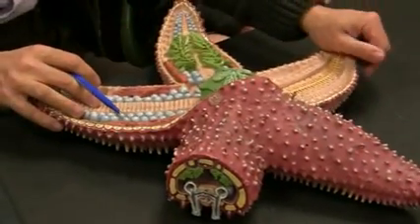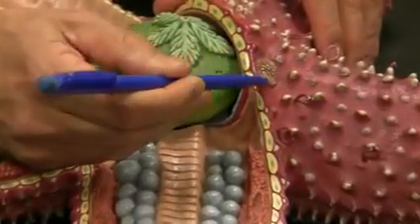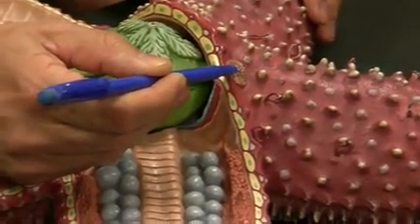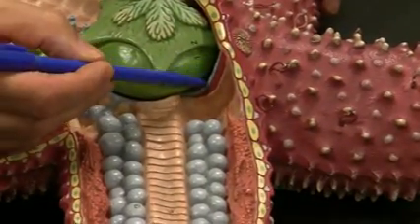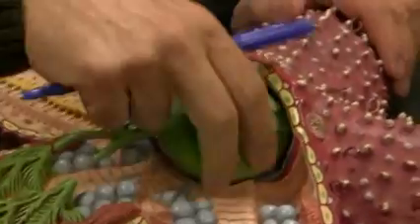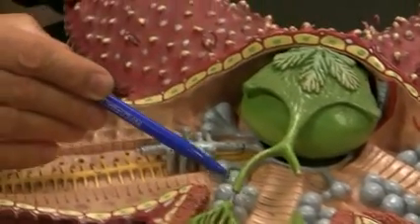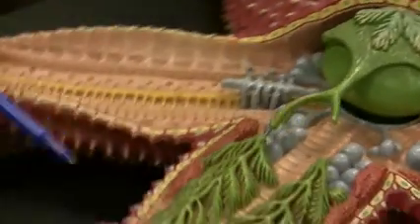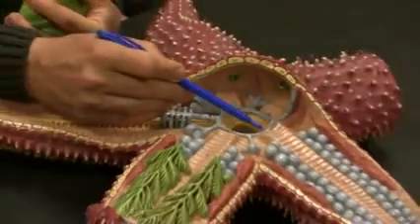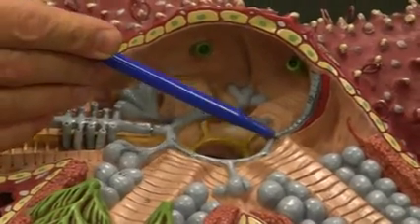Okay, then this is the madreporite, right here. Madreporite is part of the water vascular system. I will talk about it in lecture. Then this is called the stone canal, right here. Stone canal, and then you do have Polian vesicles. These are called Polian vesicles, right here, and I will talk about their function in the lecture. Then you have the ring canal: stone canal, ring canal, Polian vesicles.